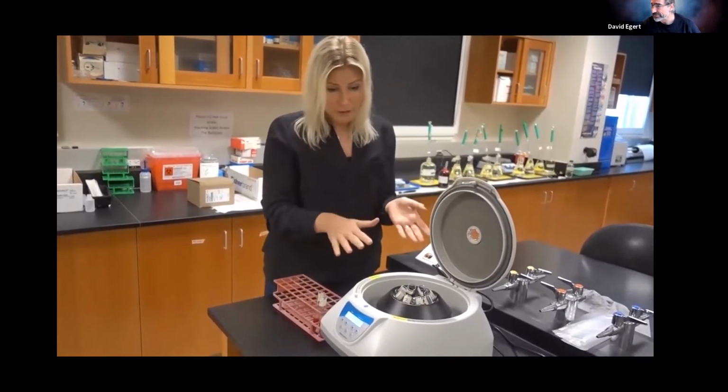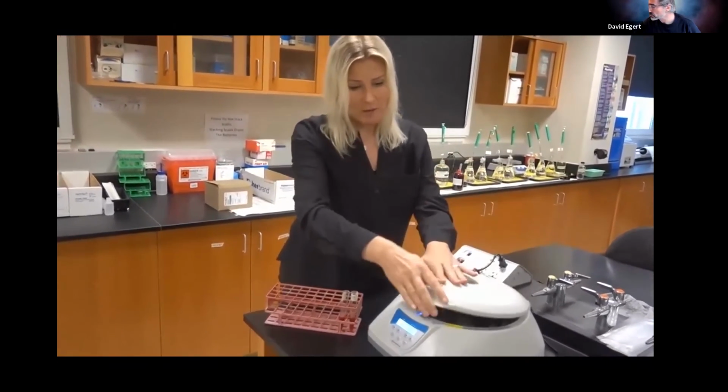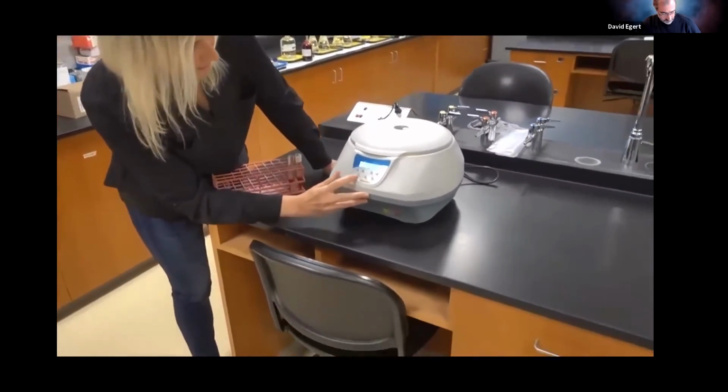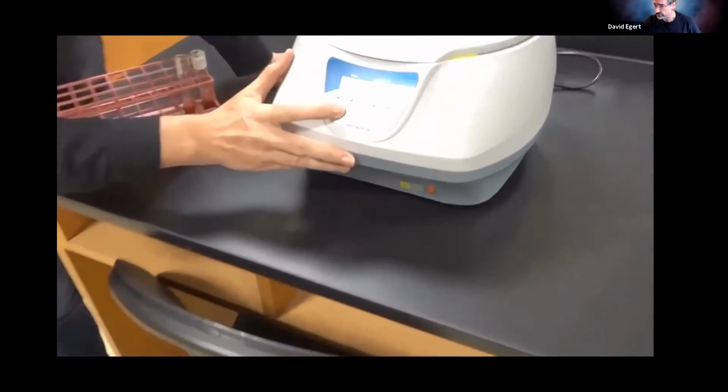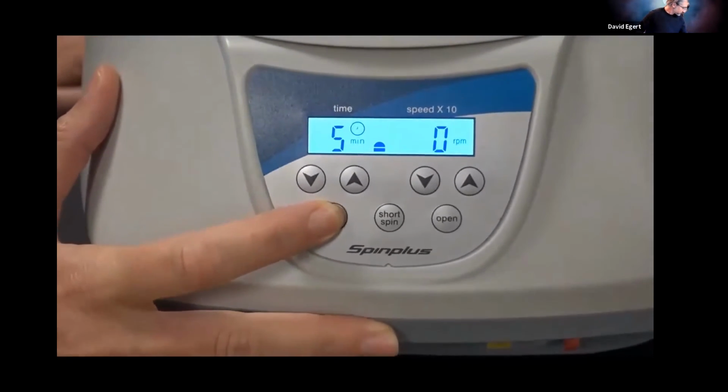All right, so we're now set. We're going to have to save 2 test tubes for later. You close it, and then all you need to do is hit start. This thing should start up, and then it stops automatically after 5 minutes.